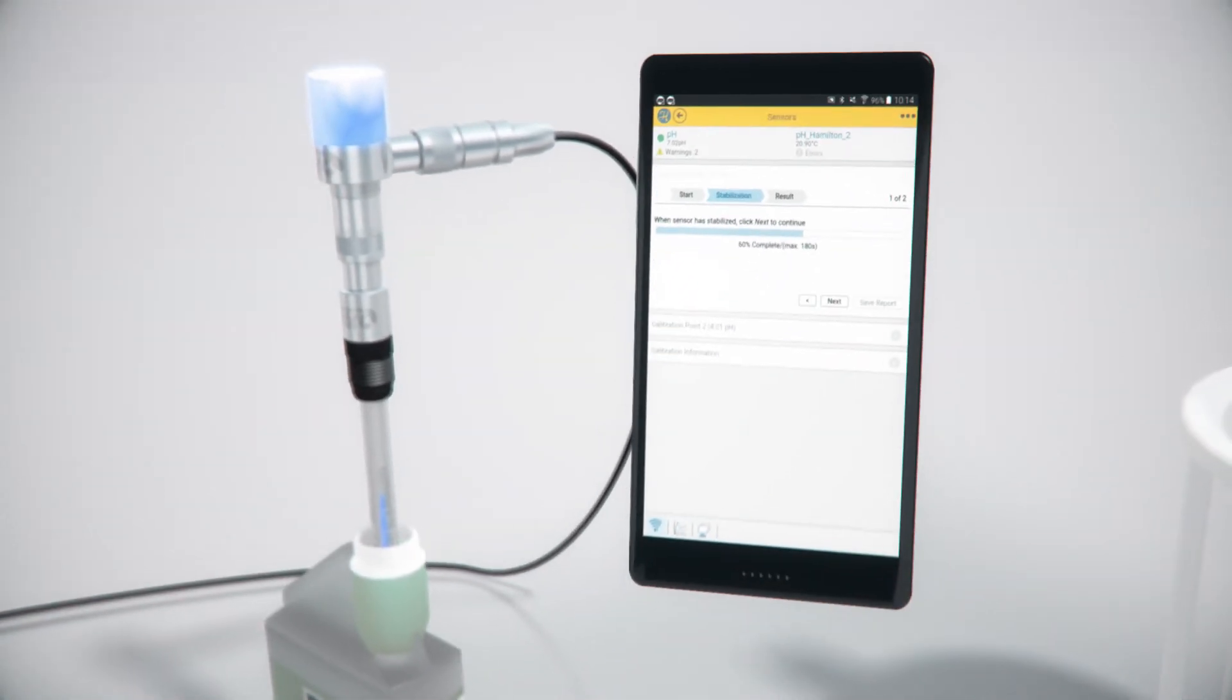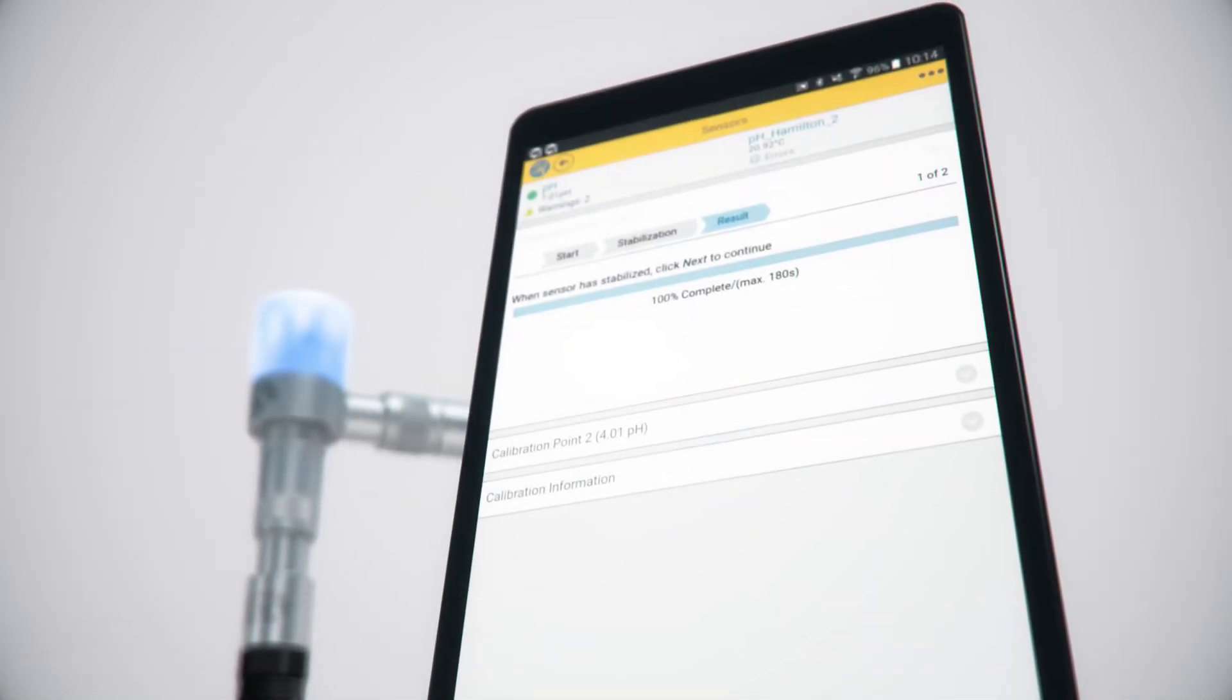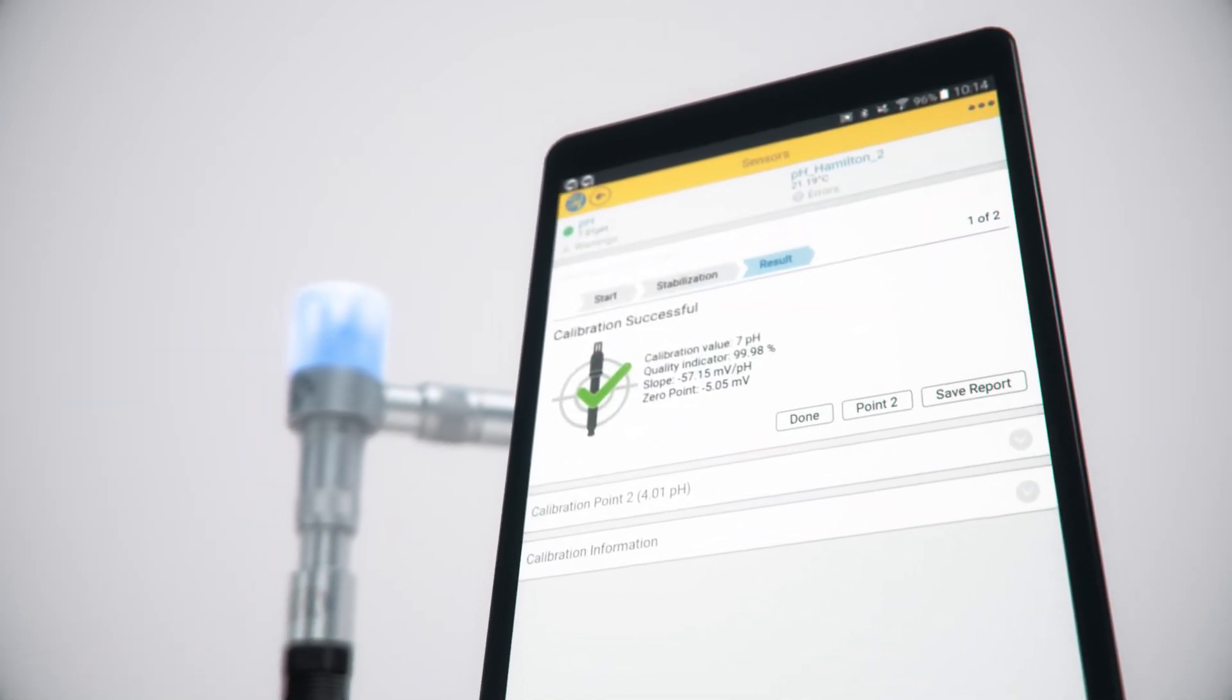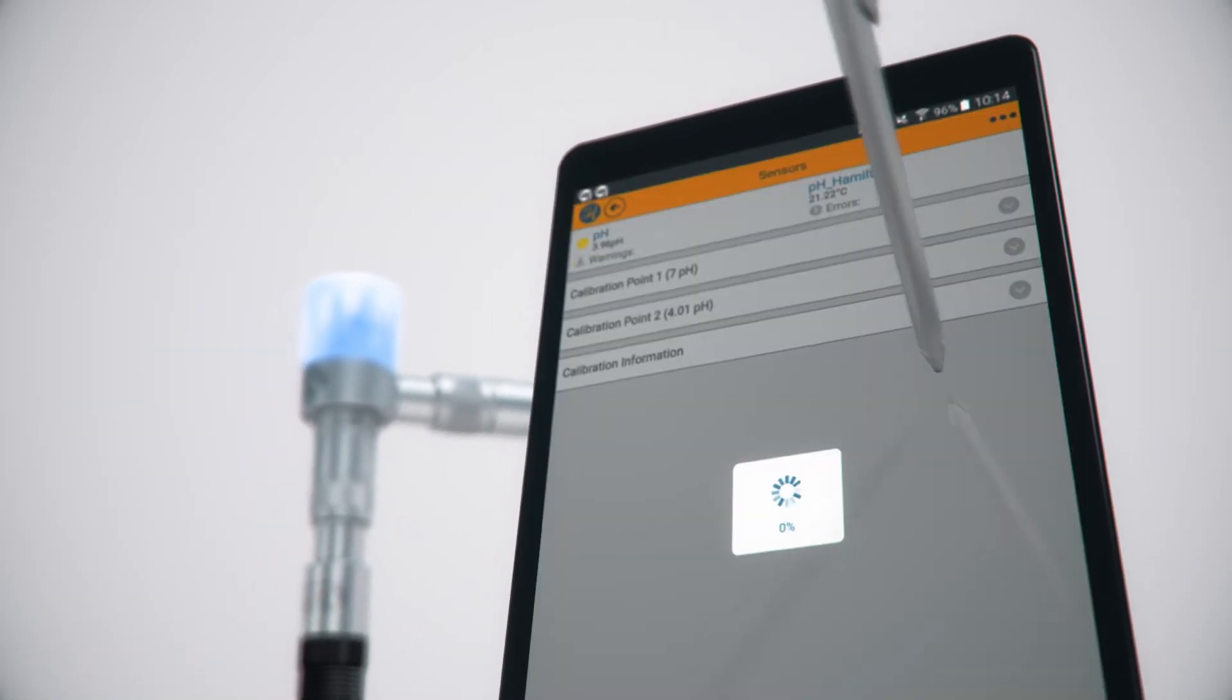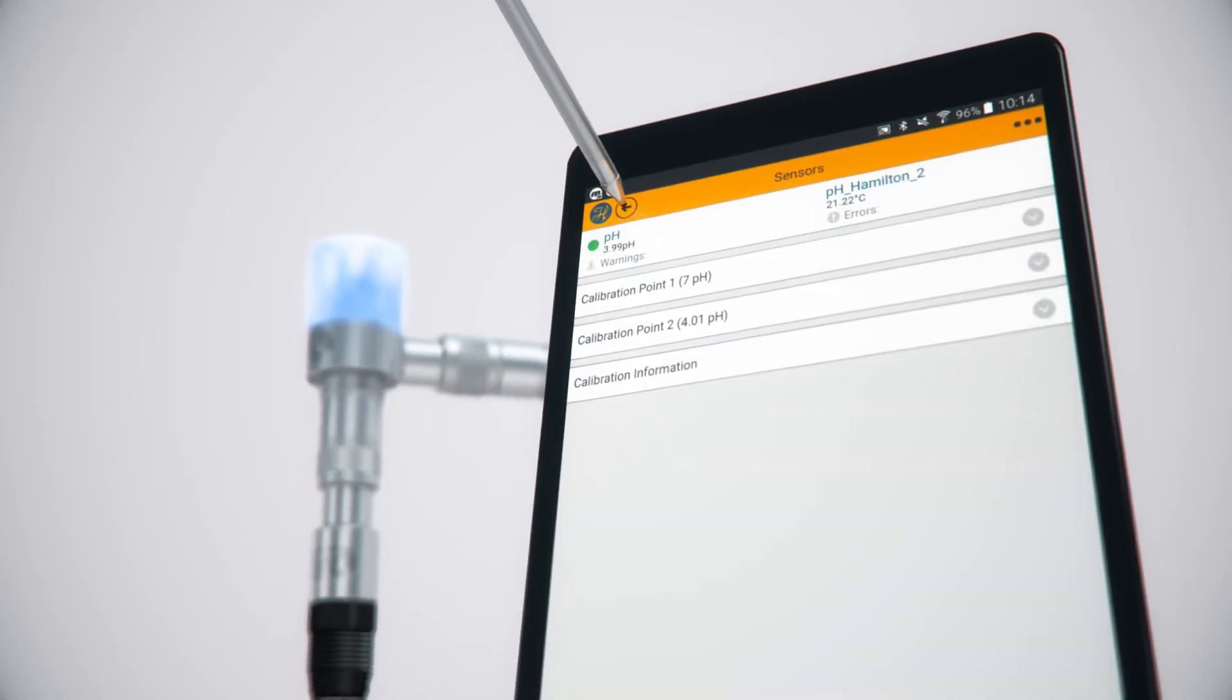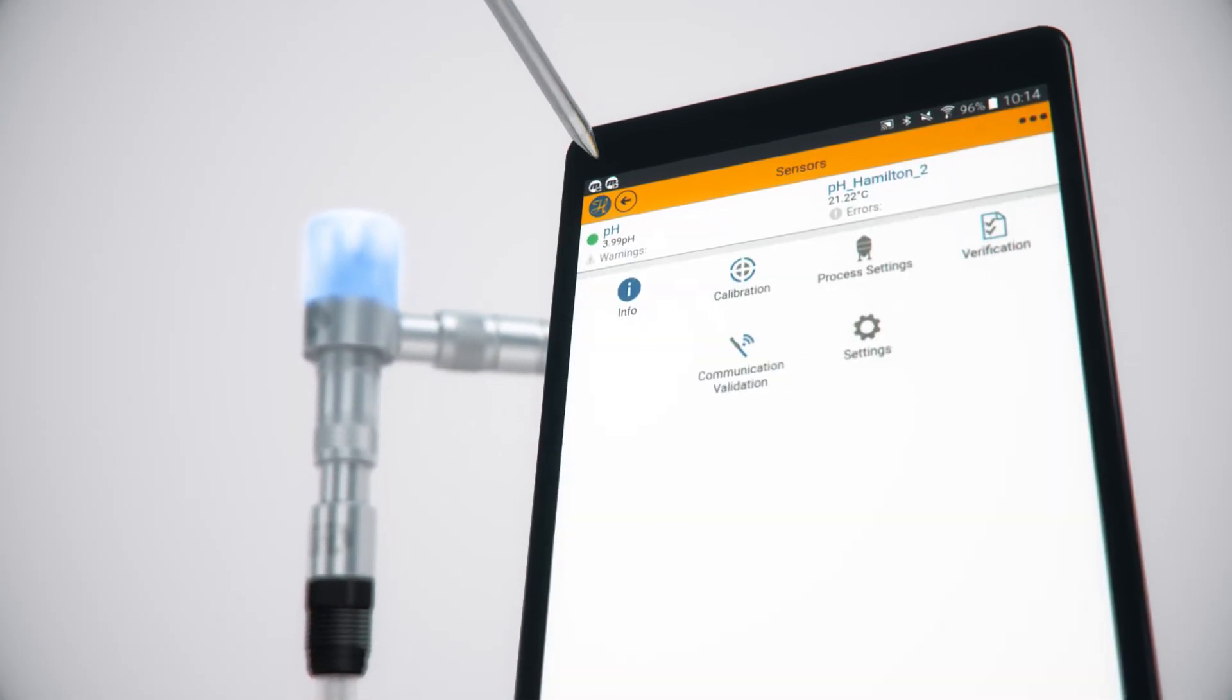Once diagnostics is completed, both ARC-Air and the sensor head provide visual indication that the sensor is now in good condition.